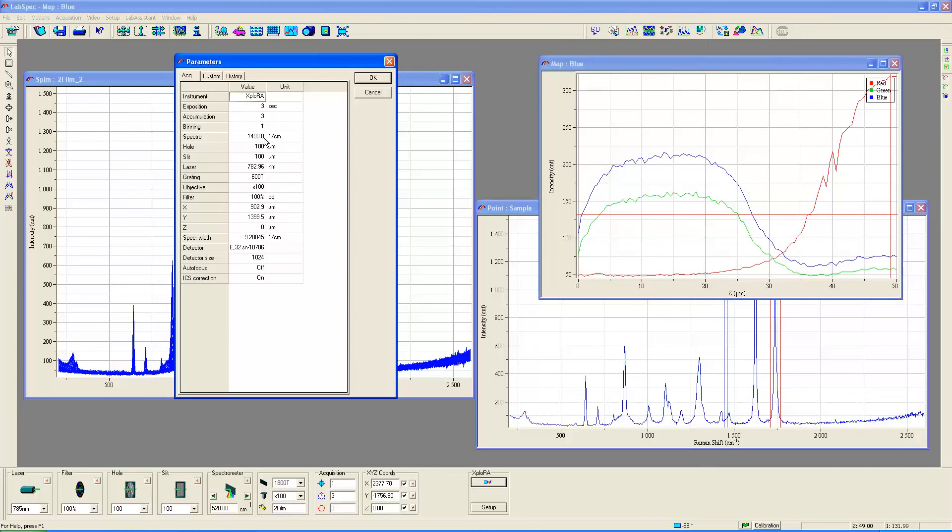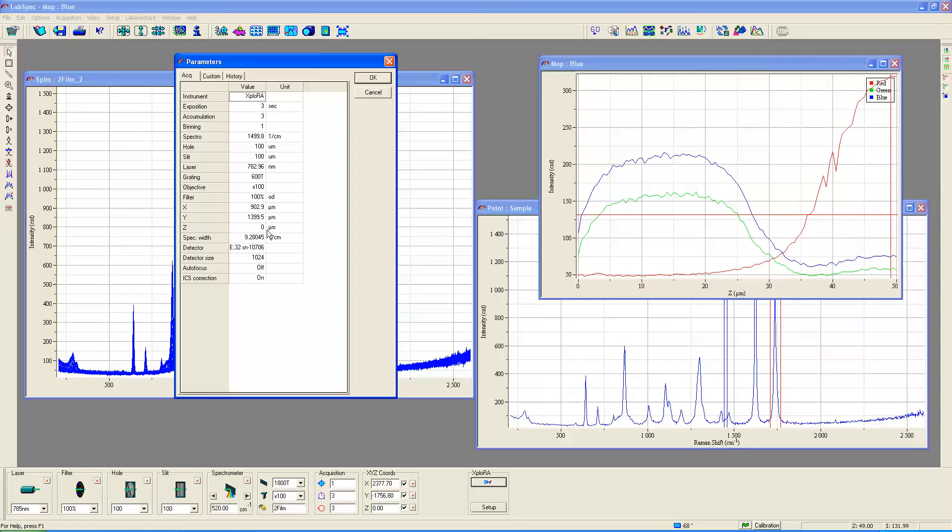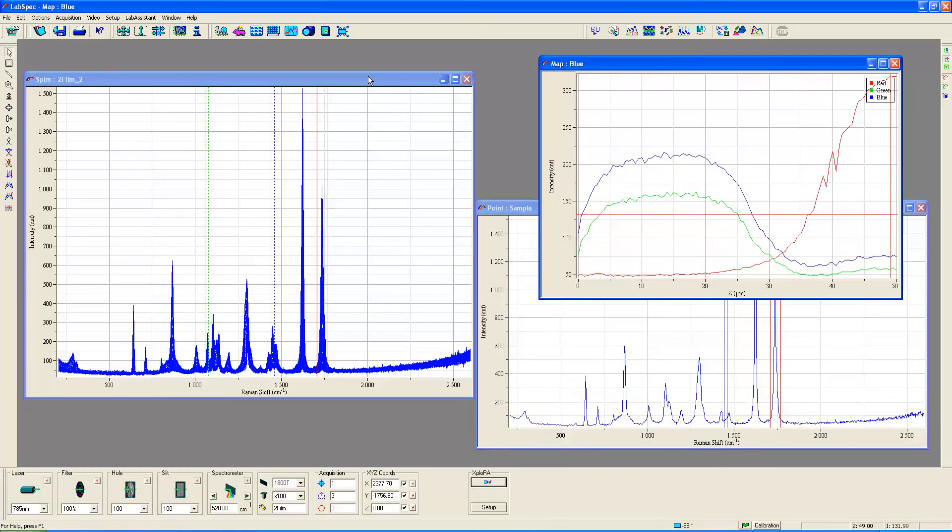A total of three seconds for three accumulations which is to say a total of nine second integration time with the spectrometer set at 1500 wave numbers. This is our actual laser wavelength and all the other settings are indicated here as far as the detector size, the CCD and the original z position of the stage zero.